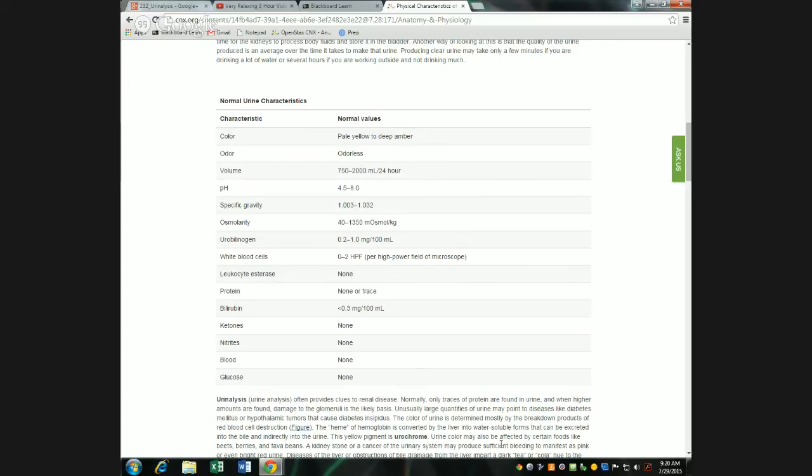So make sure that you have the same volume as me. We need them all to be the same volume because when we spin it in the centrifuge, it has to be balanced. If one has 12 and one has 11 and one has 10, they'll be all off balance and the thing will not work properly. So make sure that yours has this much in there, and if you don't grab one with the marks on it, compare it to mine.